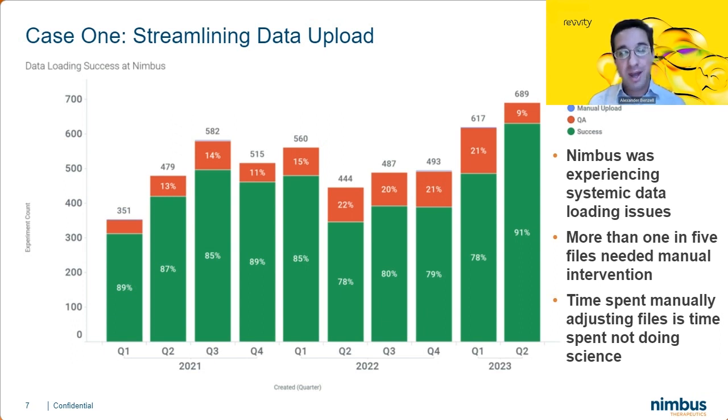They're doing data formatting, which is not what we want them to be doing. That's not an efficient utilization of resources, whether it's our scientists or CRO scientists. So we took a look further at this and said, well, in these, where aren't things working? We're only getting more and more data, and it's not going to get easier. It's not something that's going to go away. So what can we do about it?